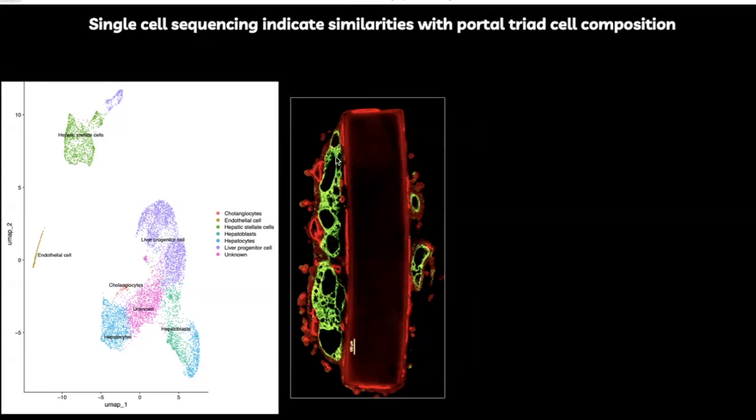Here they really look like polycystic. But you see that now you have two very characteristic things that happen every time. Along the rod, between the rod, which mimics the portal vein, and the lumen here, which is the bile duct, you have this monolayer of cells that express VE-cadherin and that really look like endothelial cells. So they sort of intercalate between the rod and the bile duct.